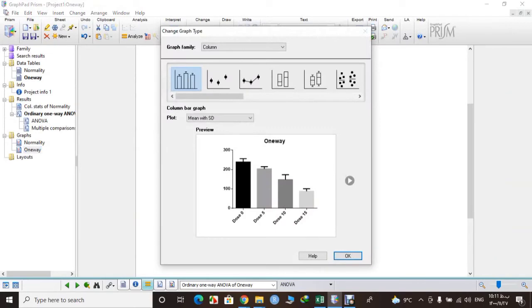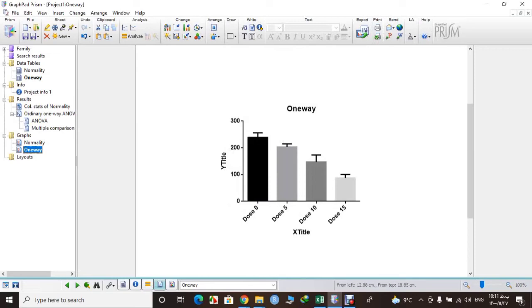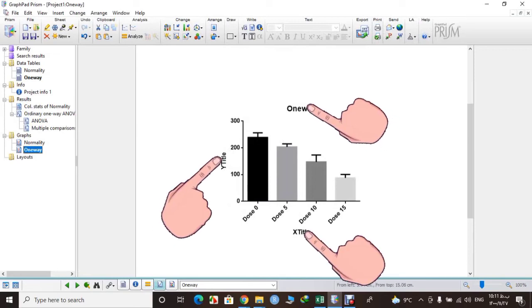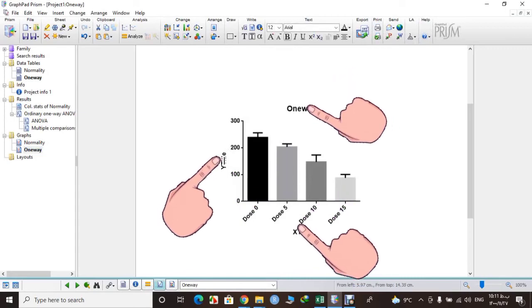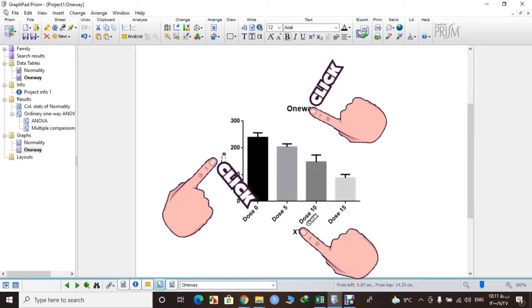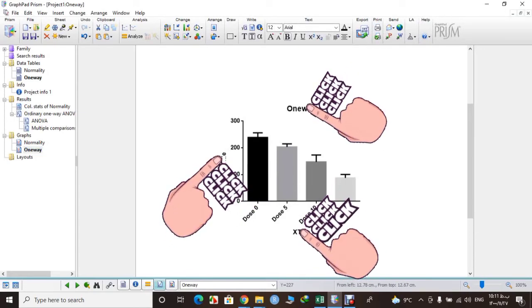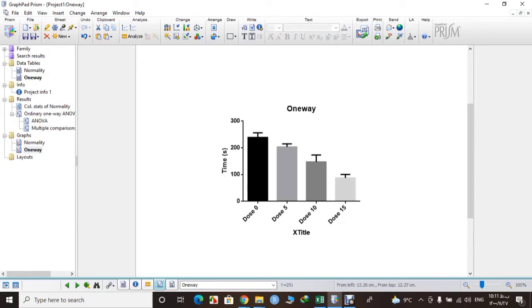You can select what type of graph you prefer. You can just change the title by clicking on them. For example, our variable here is time in seconds, so let's write it here: time in seconds. Okay.